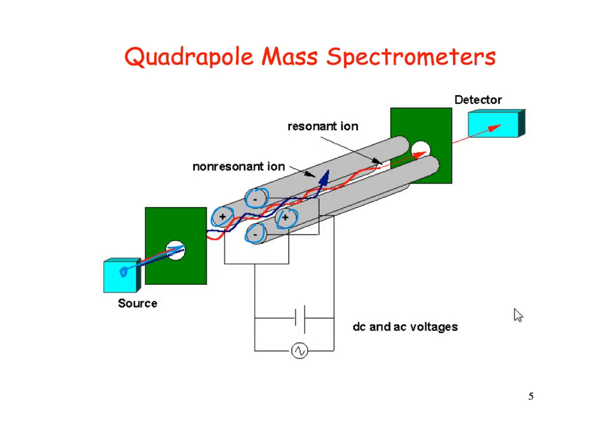How the strength of the charges and how fast they alternate, they can send the ions all the way down through this quadrupole. Okay? And I think based upon the charges and the rate, they can select or scan through the different mass to charge ratios as well.